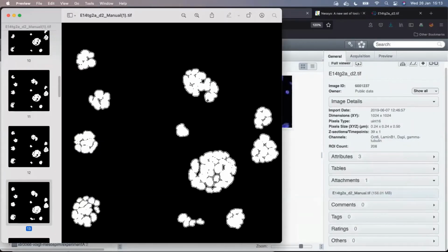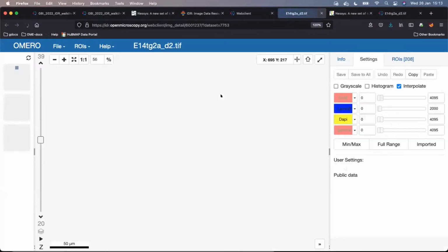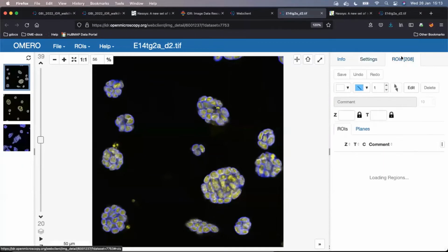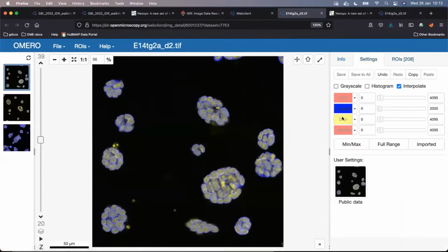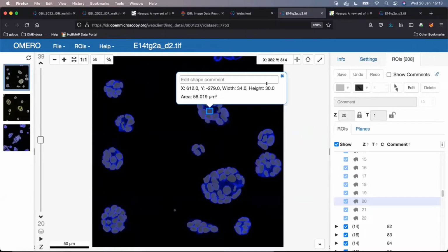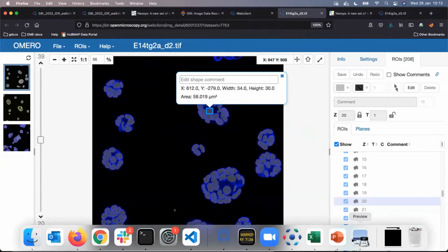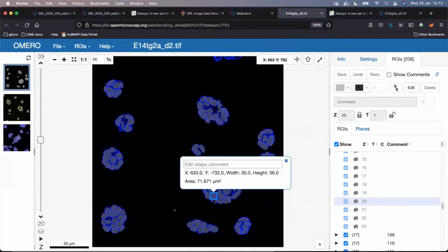These images are kind of underwhelming, and they are completely replaced by the IDR team making the effort to put those ROIs into Omero itself by the virtue of turning them into Omero ROIs. Okay, so now when I switched on the Omero ROIs here, the information in those TIFFs is completely now absorbed and replaced by these ROIs inside Omero.